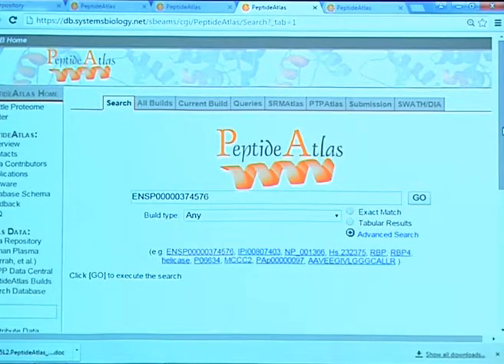Is there anything anyone has a question about? Again, a resource like this is probably a little hard to understand at first blush. There are a few things that you can pretty quickly find, but it just takes a little bit of playing around with. Hopefully, if you guys have any questions, I think you have our email. Actually, at the very top of it, there's an email for Eric Deutsch, but I think you should use mine.